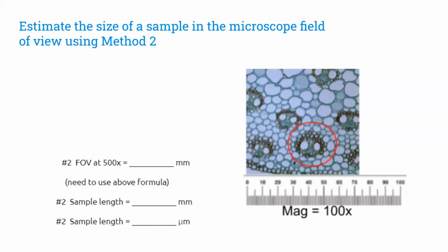We did the smaller section, which is what I wanted, but I didn't make it clear. Well, this was our fraction, right? So we would still start with 14.6. We're doing our field of view times, what's our fraction? 1 over 3.5. Okay, so what's that? 14.6 divided by 3.5? Is that what we did here? 1.7? Okay. In micrometers?